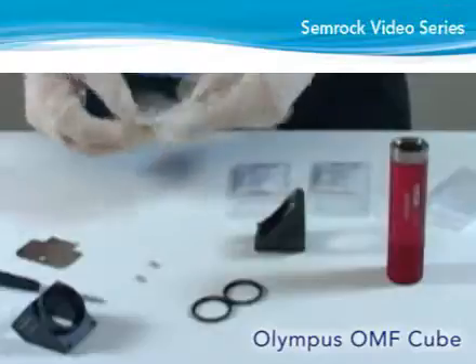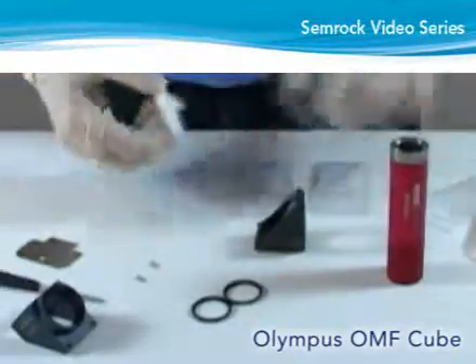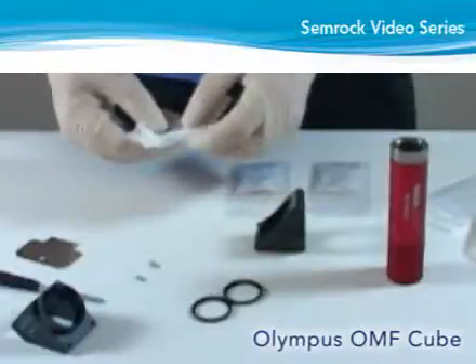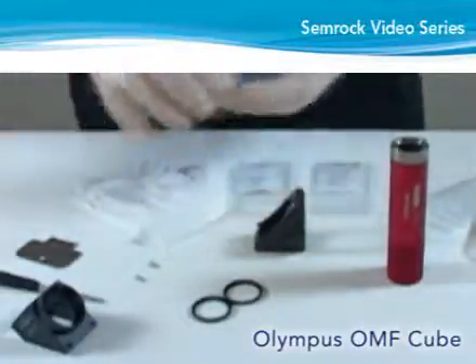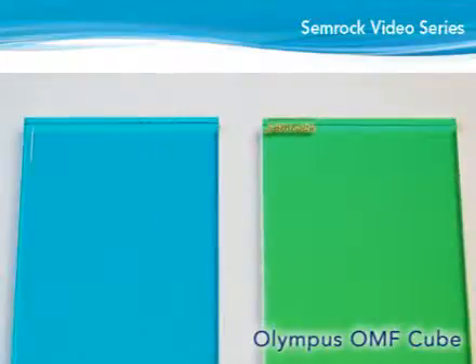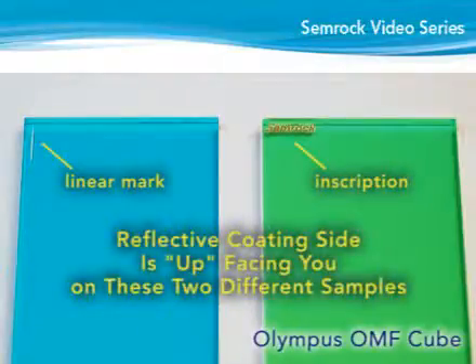Next, determine the reflective or coated side of the dichroic for proper orientation in the cube. If the dichroic has a small linear mark or inscription in one or both corners, the reflective coating side is facing you when the long side of the dichroic is vertical and the mark is in the lower right or upper left corner.